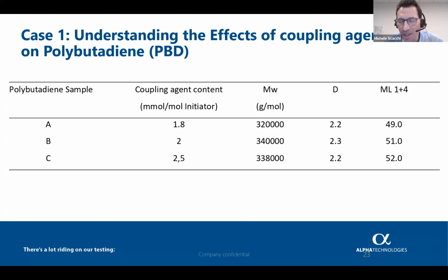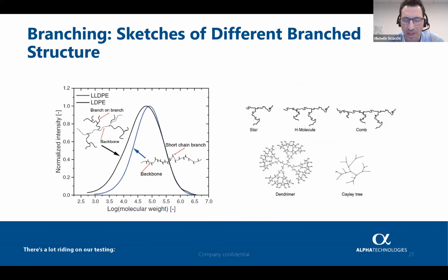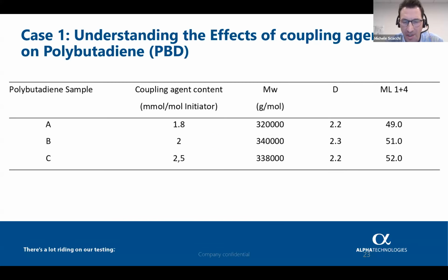After the standard Mooney test, the Mooney relaxation test cannot provide additional information. We have checked, of course. And as mentioned by Rick, since the coupling content in the different samples that we have examined are really small, the variation is very small, we didn't find any additional technique that was so sensitive to determine the branching content.